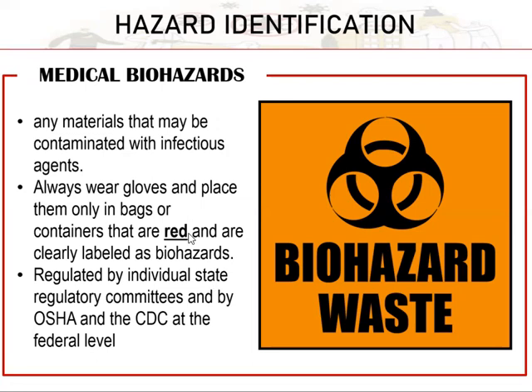So, it should be placed in a red container. If a red container is not available, as long as the biohazard symbol is present or attached, that is still acceptable. This one is regulated by the OSHA and the CDC.